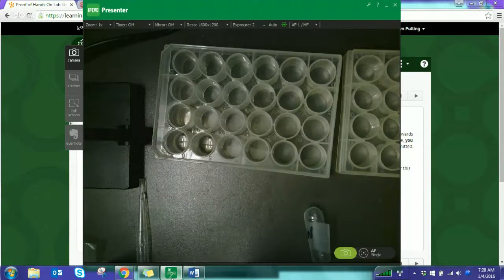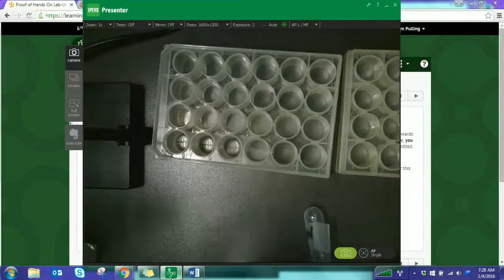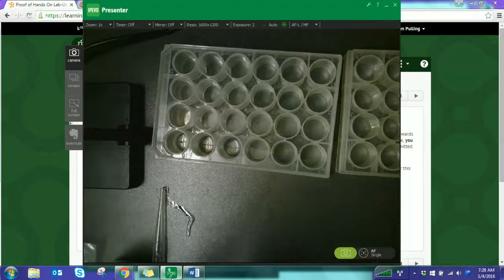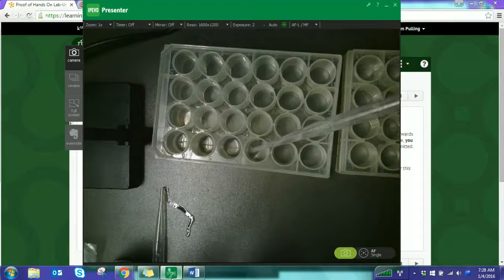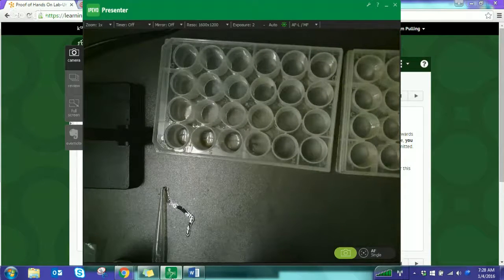And then the next one should be 1 pipette of alcohol. So we're going to do 10 drops of just alcohol. 5, 6, 7, 8, 9, 10. These pipettes do like to kind of start dropping right away, something to watch out for. And the fourth one is going to be water. 1, 2, 3, 4, 5, 6, 7, 8, 9, 10. All right, go ahead and shake that around a little bit just to make sure that it's covering the bottom.